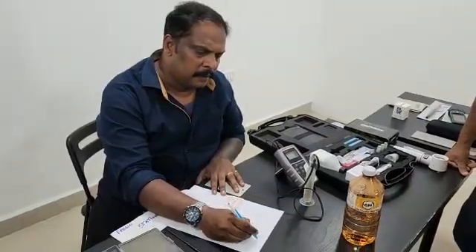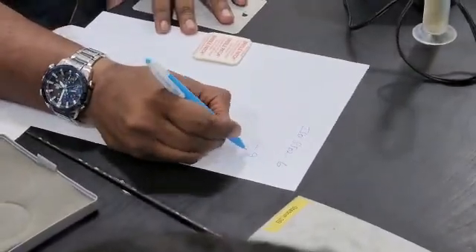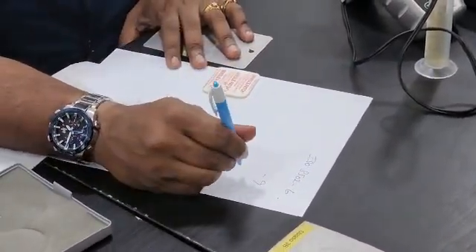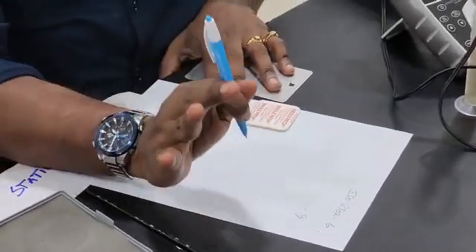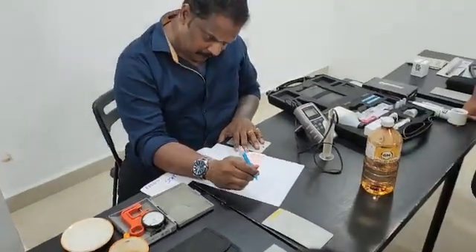We are going to refer to ISO 8502 Part 6 and Part 9. What is Part 6? Extraction method. What is Part 9? Conductometric analysis. First you have to extract the salt from the substrate, then you have to analyze it.